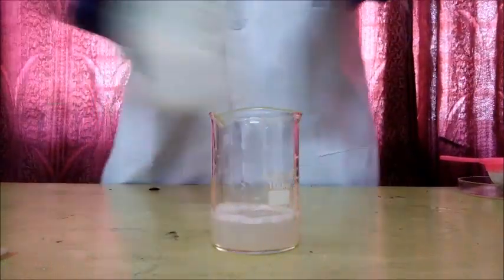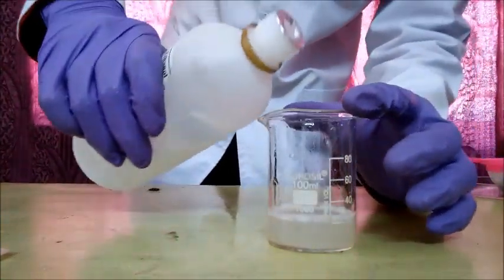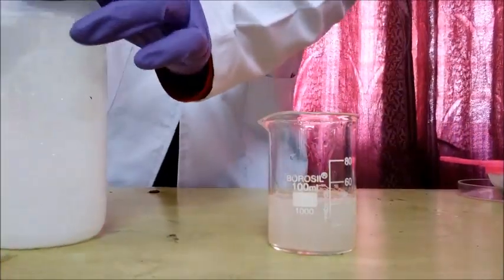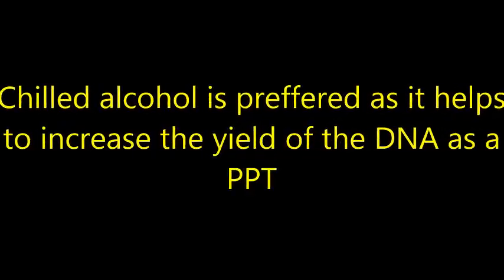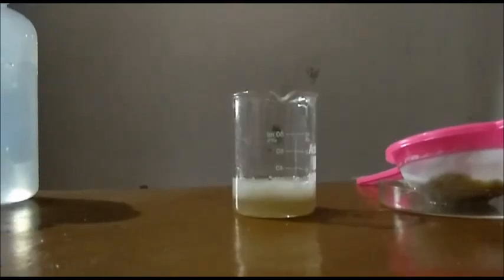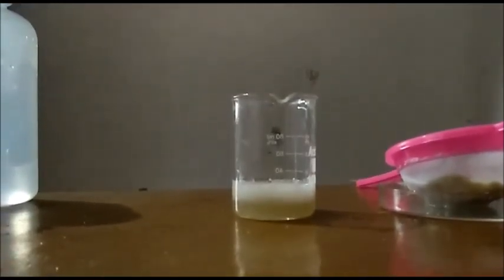We will take rubbing alcohol which is ice cold and add it in an amount equal to the liquid present. We will leave it for 3 to 4 minutes. As you can see, there are 2 layers — the layer at the upper surface is the alcohol in which the DNA is mixed, and the layer settled at the bottom is the juice of the banana mash.